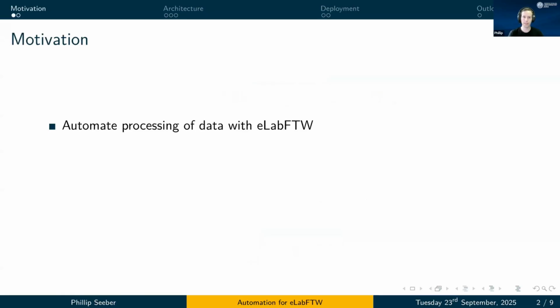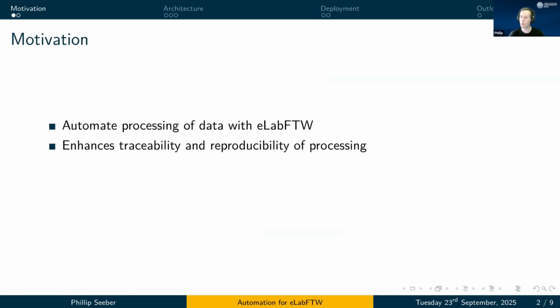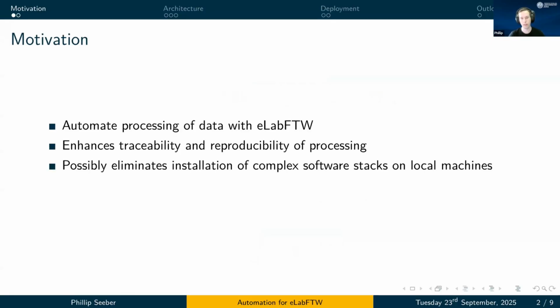So the idea here is that we want to have some kind of automatic processing of data that lives within eLabFTW. Because this, for one, enhances traceability and reproducibility. If you have your code and workflows in a central location, you can use eLabFTW to track those processing steps. But it also possibly eliminates the installation of complex tooling or software on local machines, and also removes the burden to remember to do possibly some conversion and automation steps.